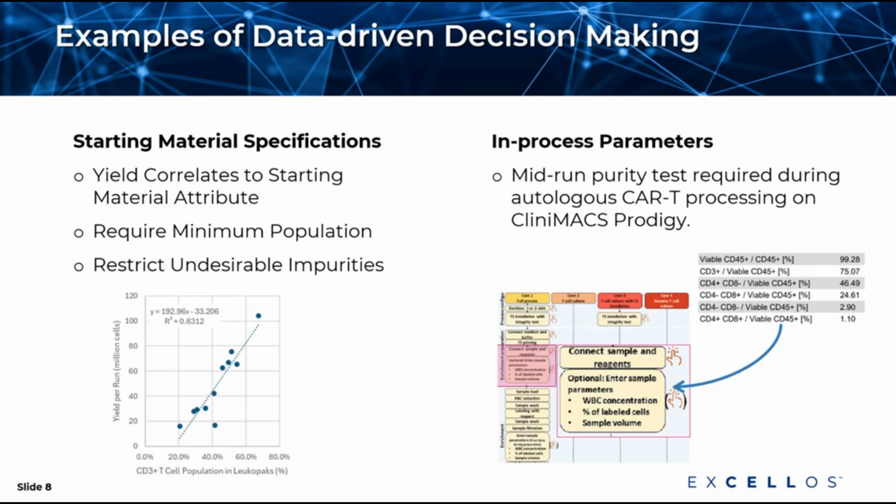When we're in the clean rooms, we have our operators, whom we don't want to be idle, and our EM technicians continuously monitoring the process, even if they're waiting for this information. And we don't want to risk any errors on the QC side, which could cause delays. This is all really about having those in-process parameters up front to reduce any risk of failure.